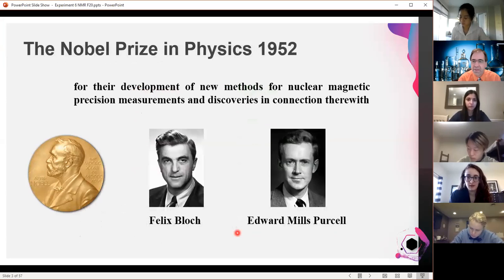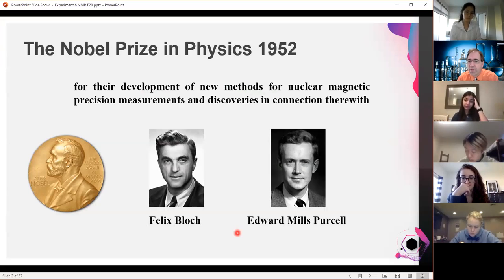Okay, so this did get the Nobel Prize in physics in 1952. It's a very important technique. They realized it even as it was first coming out. It was actually discovered by physicists, and they were looking at the effects of the radio waves on the nuclei. The story, potentially apocryphal or not, I'm not sure if it's true, is that I believe it was Dr. Purcell, they discovered this, but they weren't quite sure what to do with it, was having lunch with one of his colleagues who was a chemist, and said, you know, would it be useful to know about the electronic environment around a nucleus? And he was kind of like, yes, can you please give me that tool? And we went on from there.